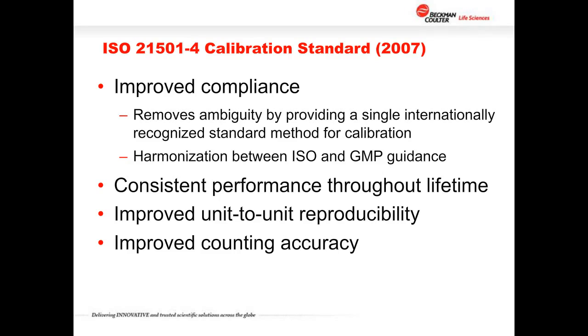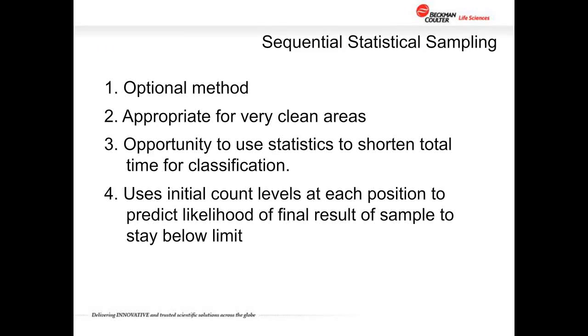The downside, of course, it takes a little bit longer to do that calibration, takes more effort, and generally will somewhat increase the cost of that. But it does gain something for us in terms of the consistency of the instrument. And when you're setting up a standard, that's important. You want it to be reproducible no matter which tool you use, which instrument you use, and who does it. So that's the idea, of course, of a standard. It's reproducible no matter who does it and if an appropriate instrument is always used.